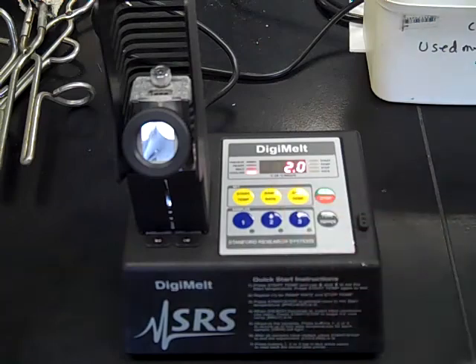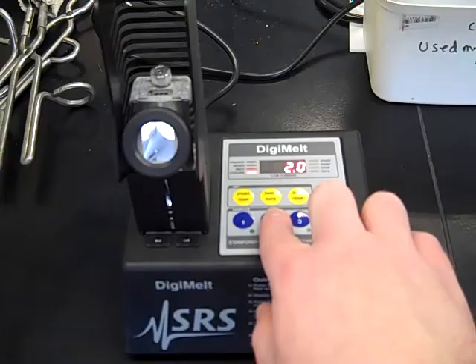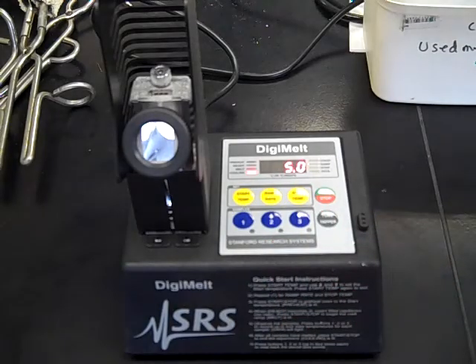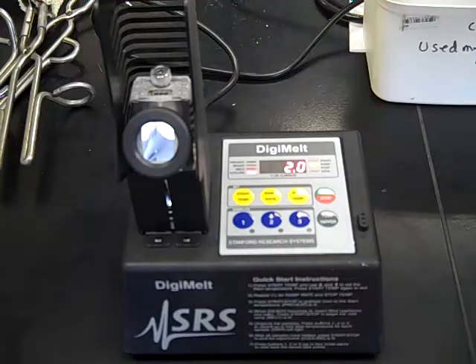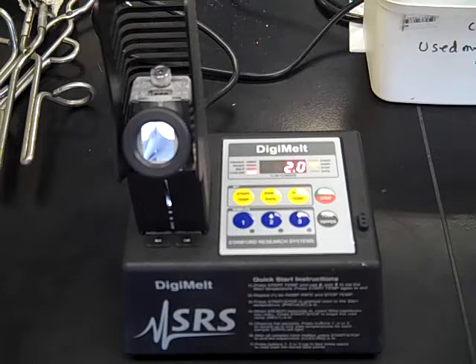For the ramp rate, you can select two degrees per minute or five degrees per minute. By selecting five degrees per minute, you run a much greater chance of missing the melting point. So to be safe, since it's only going to take 10 or 12 minutes, I'm going to stay with the two degrees Celsius per minute ramp. That means every minute it's going to raise two degrees, from 139 all the way up to 164.